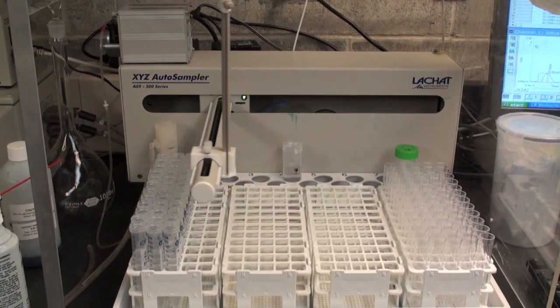This is a nutrient auto analyzer and what it does is it allows us to automate the process of analyzing nutrient samples.